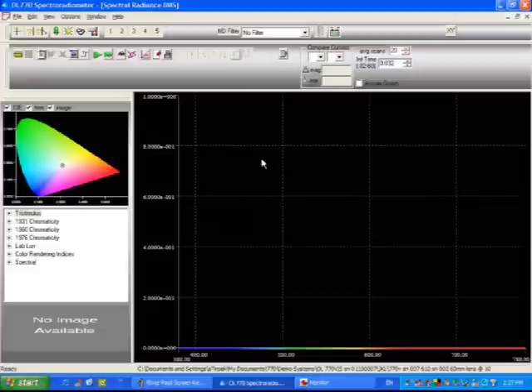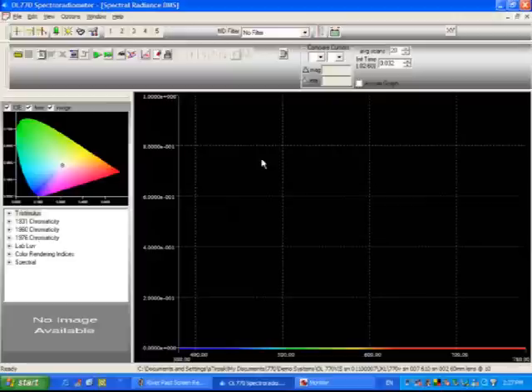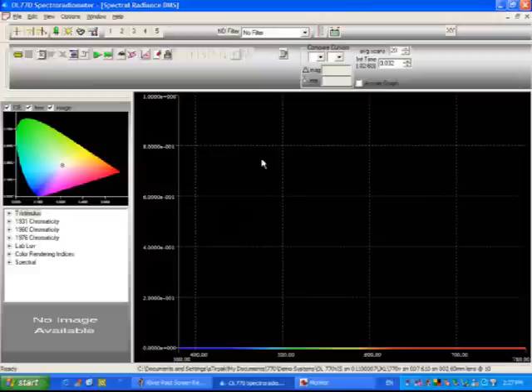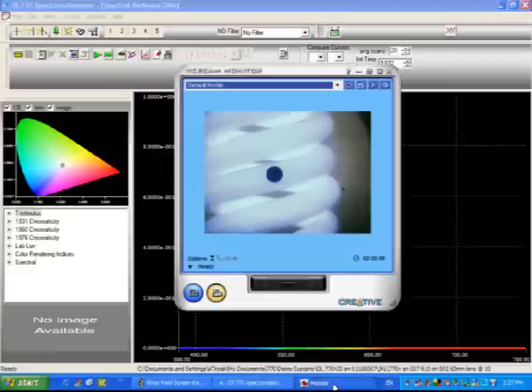I'd like to just kind of concentrate on the alignment of the camera and what you would be seeing through the reflex telescope. Now for convenience sake, we have another version of Pritchard type optics design is an OL610 CCD imaging telescope, which allows us to view actually our alignment procedure by way of a CCD monitor.